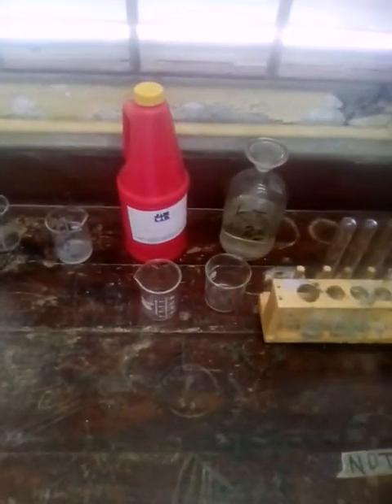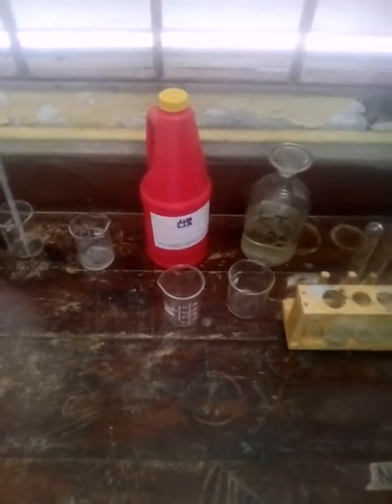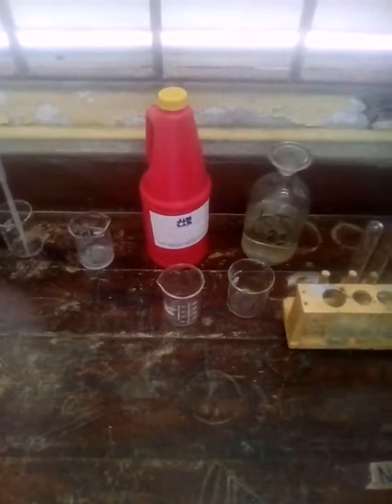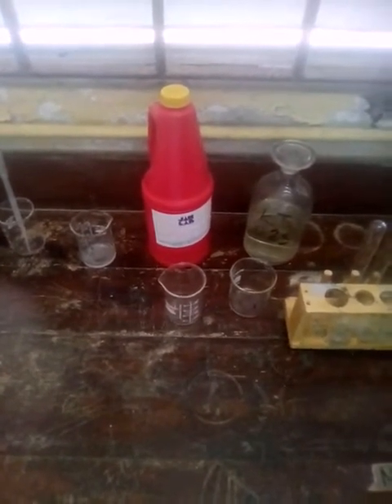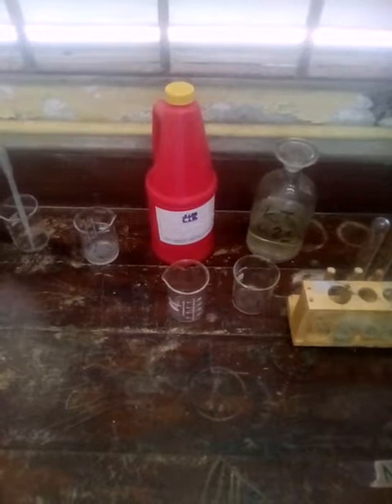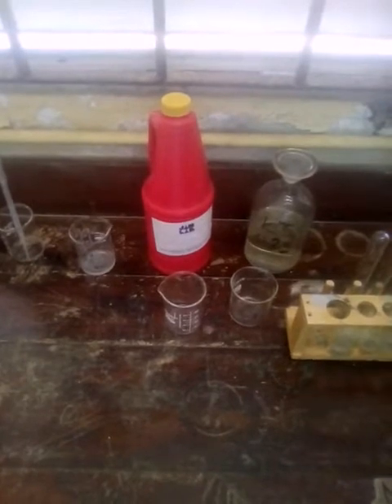Good day again, guys. Today we will be doing a reaction between potassium iodide and hydrogen peroxide. You might have seen this reaction in other places where it is very vigorous, and the product that is produced is commonly called elephant's toothpaste.